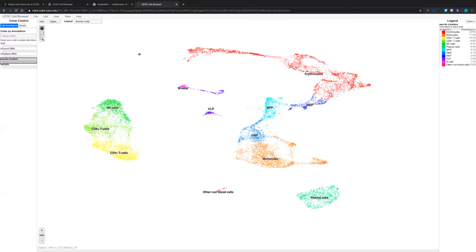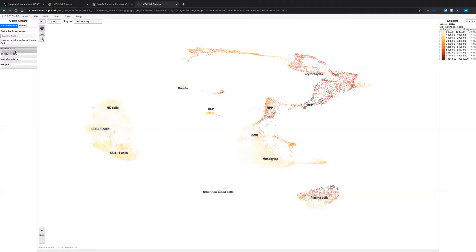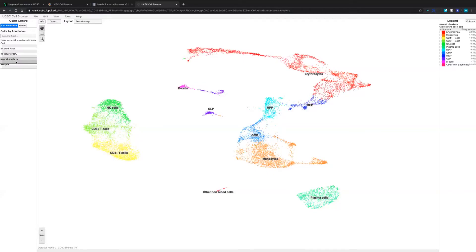The first thing we can do with this cell browser is choose to color these cells based on different metadata. For example, we can color cells based on the number of genes in each cell, or based on the number of UMIs in each cell, or based on the cell type annotation results, or based on the cell cluster results. We can also color the cells based on other metadata.